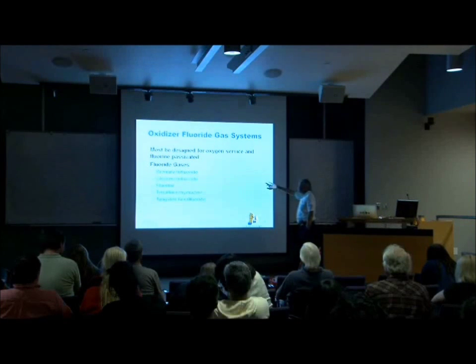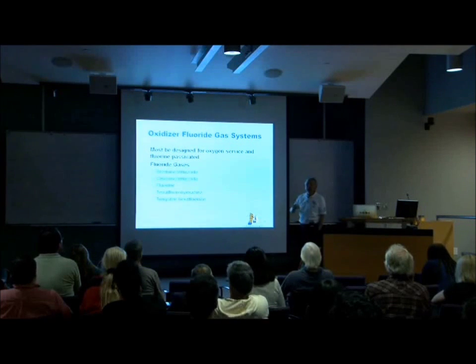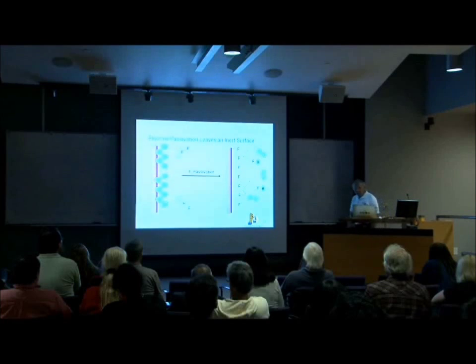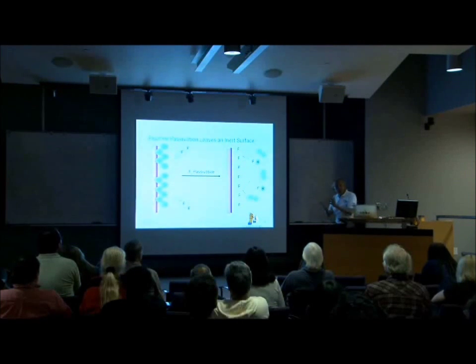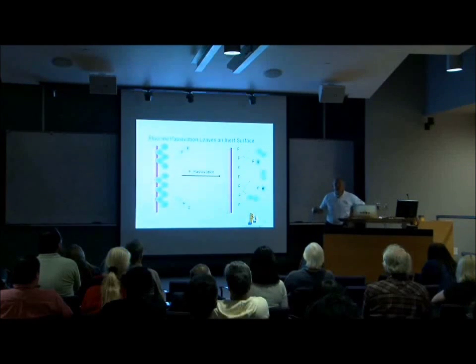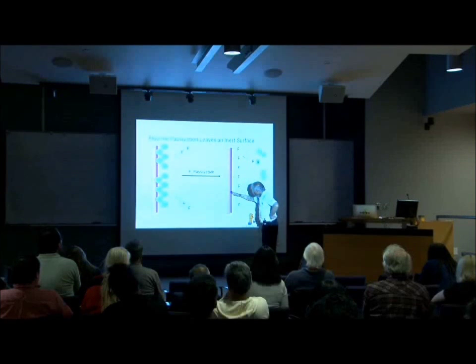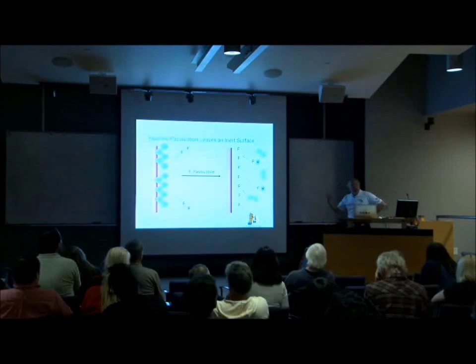If you're using materials like chlorine trifluoride and fluorine, not only do you have to oxygen clean, you also have to fluorine passivate. Essentially, fluorine passivation is you're taking a low concentration of fluorine and you're reacting the metal surface to create a metal fluoride. This metal fluoride surface will protect the system from fluorine reaction when you flow the fluorine through. If you don't do this, what can happen? The fluorine will continue eating at the surface and you'll create a hole in your system and you'll release fluorine.